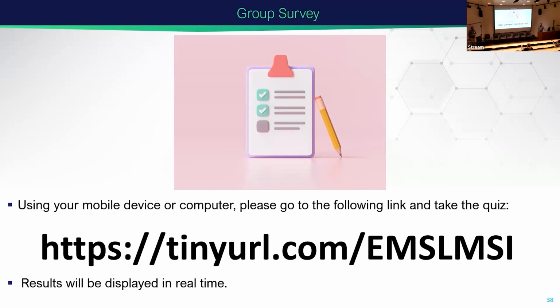So it depends. I can give a little brief introduction. We can either use things like carbon tape in order to get them onto the slide. There can be conductive copper tape as well, or a lot of these sections are just thaw mounted. So they're sectioned at -20, and then they're mounted directly on the slides from the temperature differential. And that's about it. Yeah. You can be as creative as you want, right?